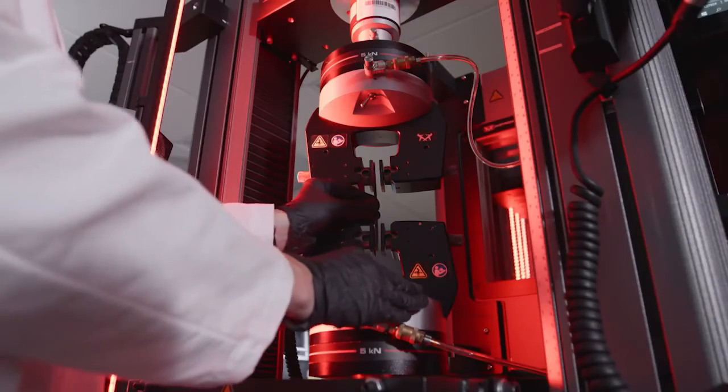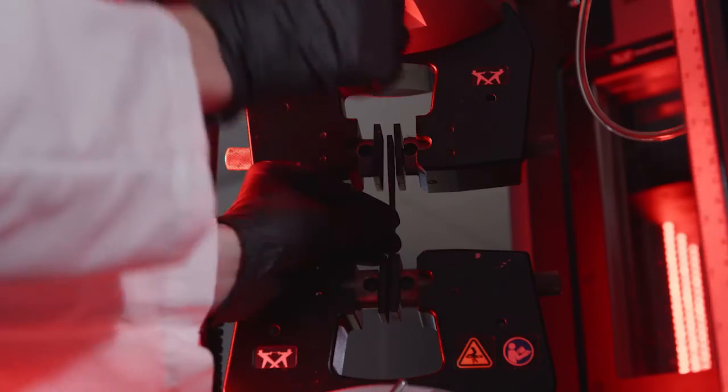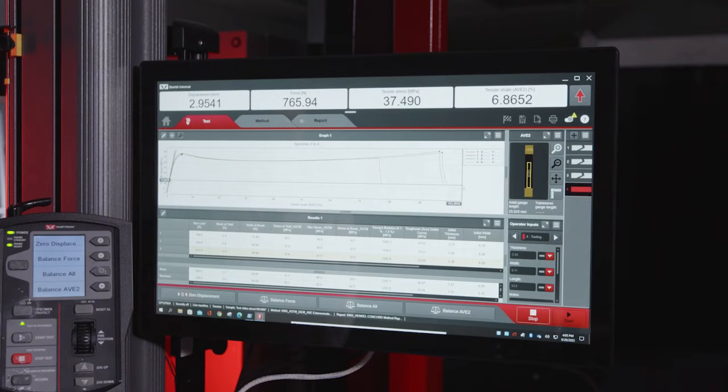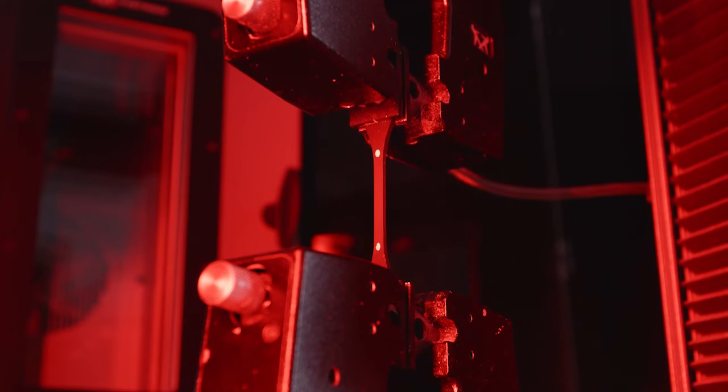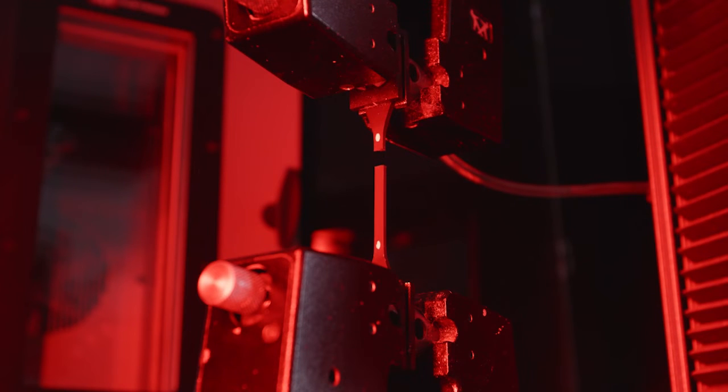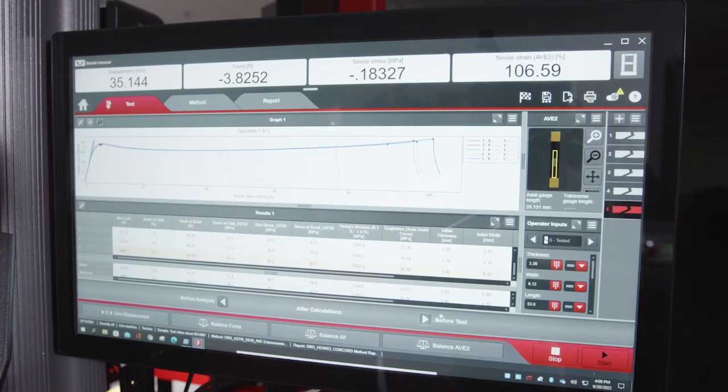The test begins when the sample is inserted into the universal testing system. The machine is connected to a screen which shows the stress-strain curve. The machine slowly stretches a sample until breakage of the molecular bonds occurs. Once the test is complete, final elongation values will be displayed on the screen.